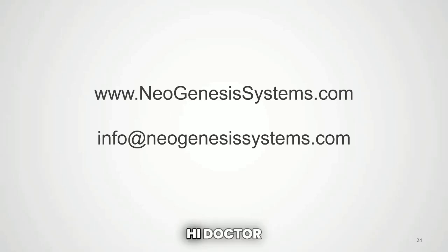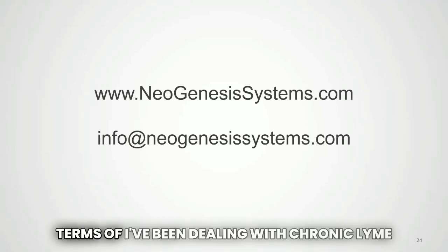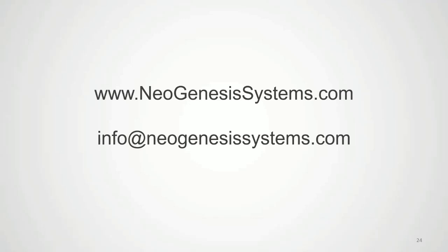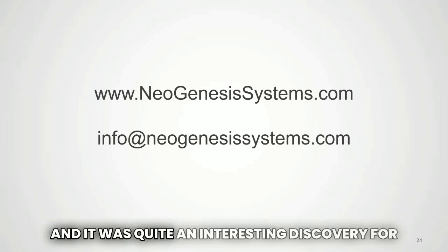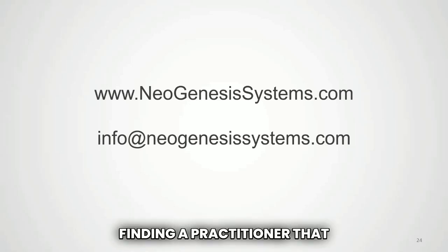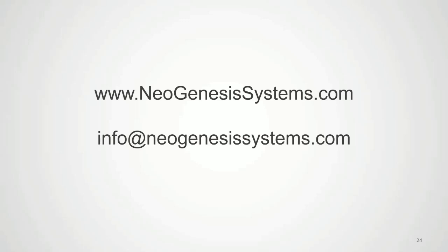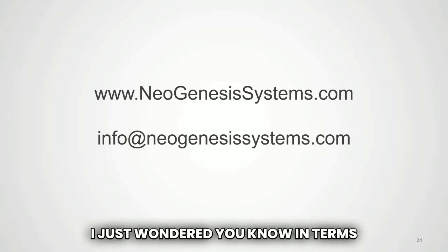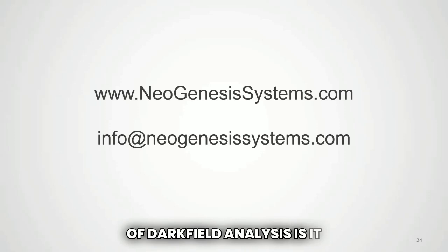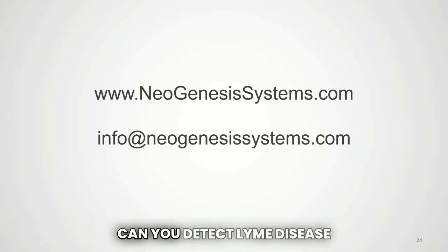Hi guys. Hi doctor. I was interested in my own journey. I've been dealing with chronic Lyme, and it was quite an interesting discovery for me, in my scramble to find a practitioner that can actually treat it, that it couldn't be seen on live blood analysis. In terms of dark field analysis, you may have already said this, but can you detect Lyme disease through the dark field?